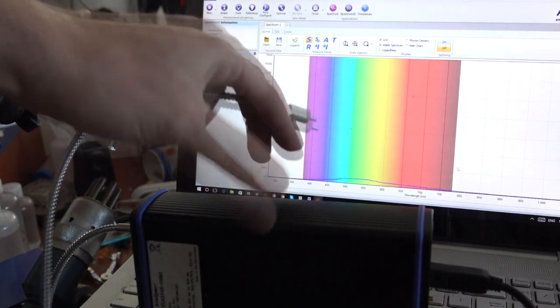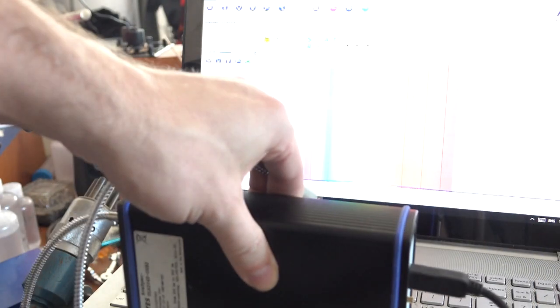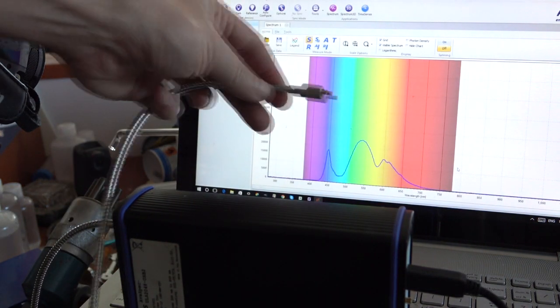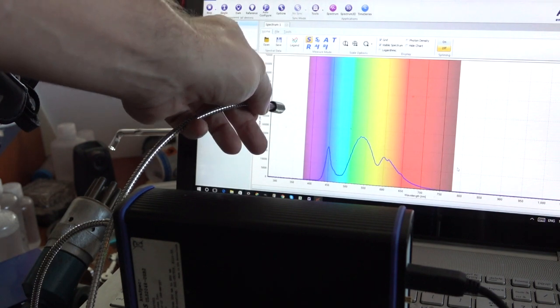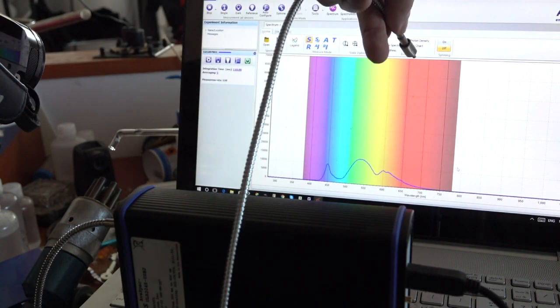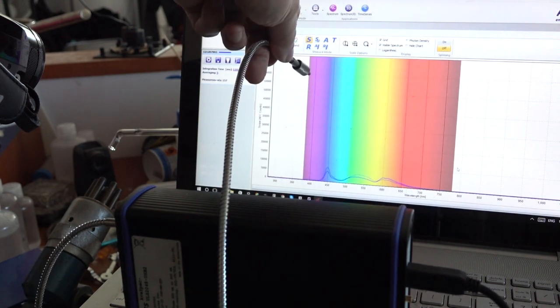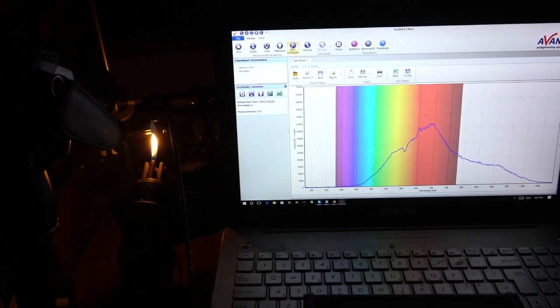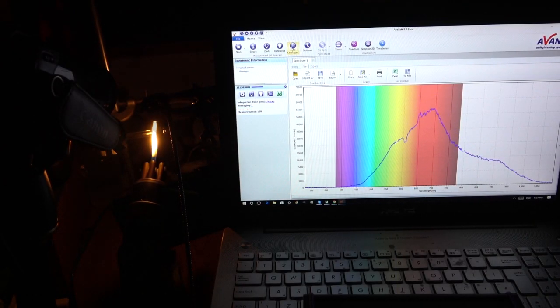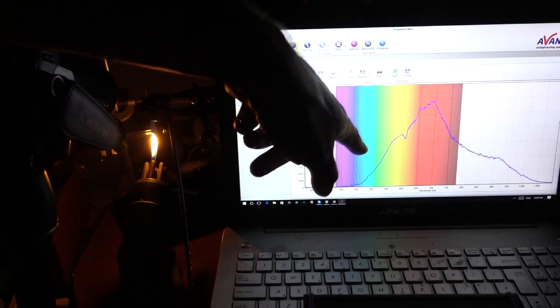Okay. So there I have my spectrometer. So if I point this—this is the spectrometer probe—the light that comes in here, it shows the spectrum on the screen. So if I point it at the screen, that's what the spectrum of the screen looks like. If I point it at the red area of the screen, for instance, you can see it looks mostly red. If I point it at the purple area of the screen, it looks mostly purple. If I point it out of the window, you get what looks more like a solar spectrum. Okay. So what we've got here is that this here is the spectral probe, pointing directly at the flame there. And this is the spectrum of that flame. So it's basically a black body spectrum, but it's peaked out in the red. Obviously, it's a reddish flame.